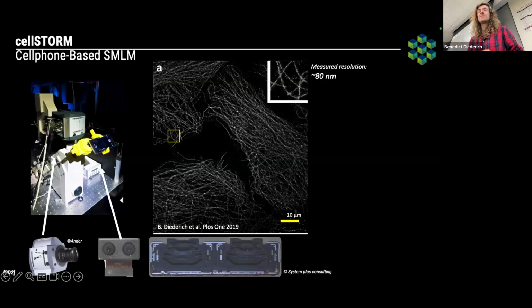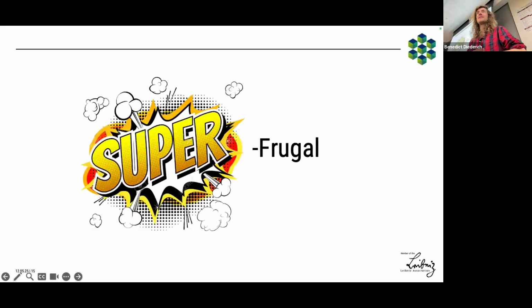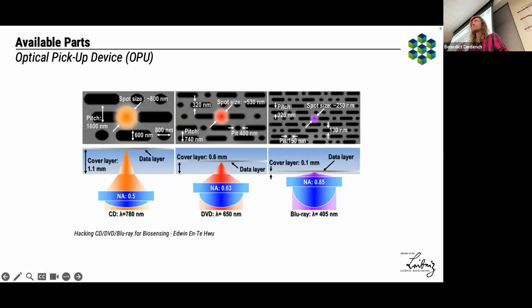And on the way, I think there's something maybe Manu already highlighted. One can think out of the box. If you open old equipment, like say, for example, this 1,000 euro machine, you will find lots of cool things. But you can also just go to the local shops here, the thrift stores. You go to the electronics section, then you may find an old DVD player.